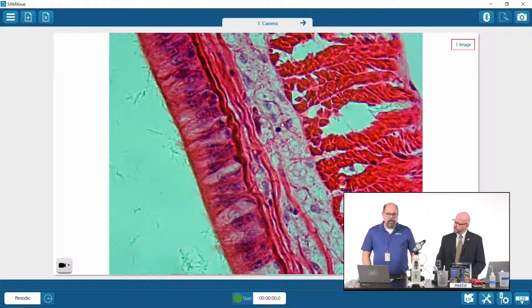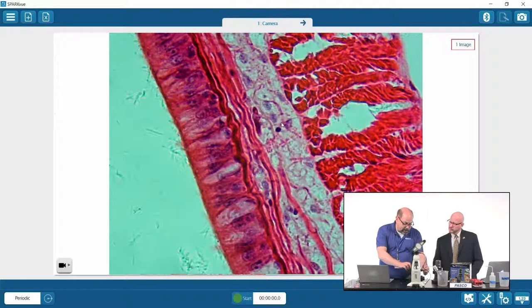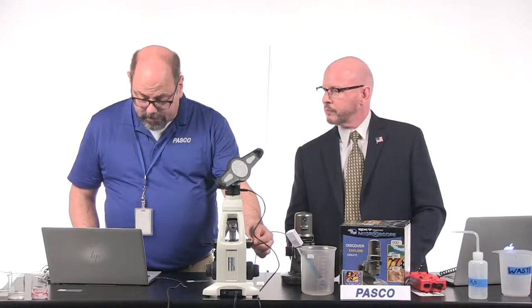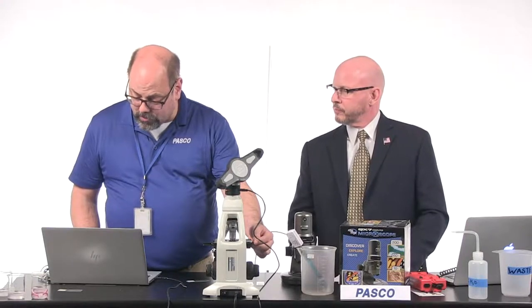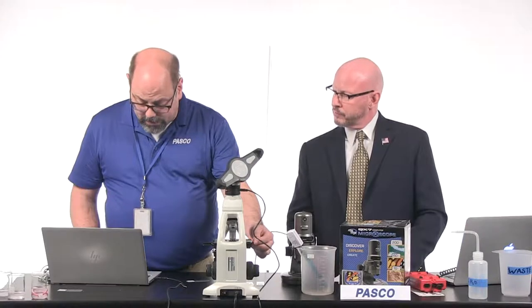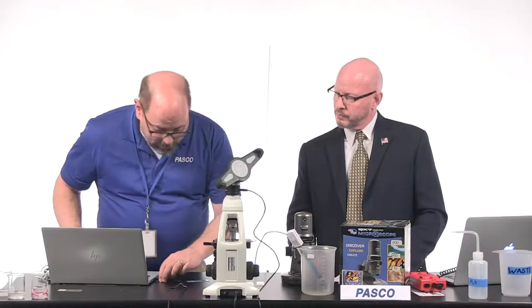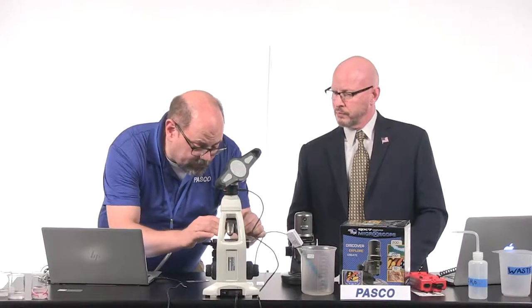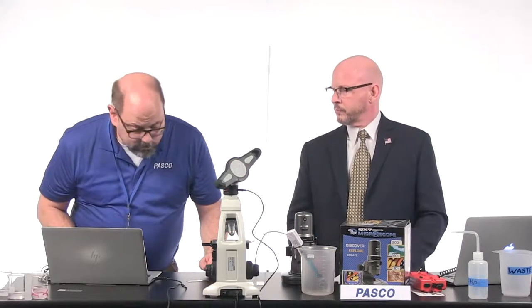What I was saying is one great example of an activity you could take a look at is if you've prepared some sort of slide, or you have slides that are prepared, let's switch this out and put in a plant cell. So I'm going to take that out. We're going to go to the next slide here. Let's create a new one. I guess I could stay with this last one too, but this is as easy as we do. We're going to switch back to the microscope, and I'll expand this so that when we put in some plant cell, we'll move that and get this centered. I may have to come back to a larger field of view. Okay, and I'll start the camera so we can see what we're looking at here.